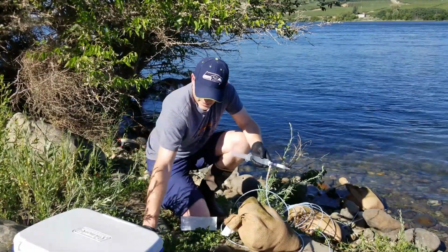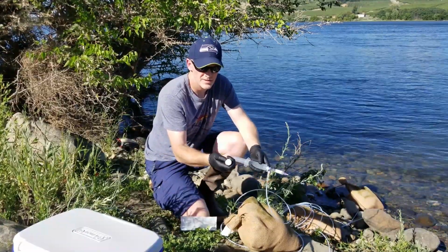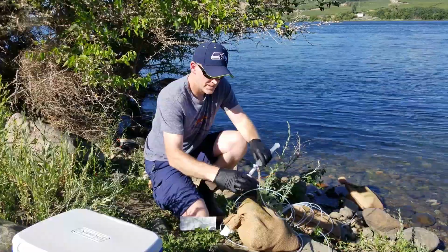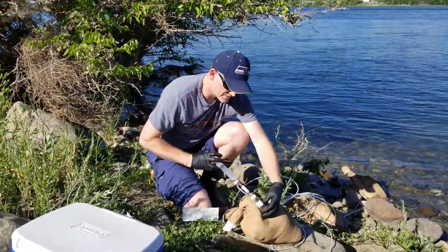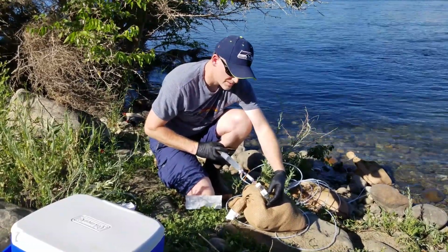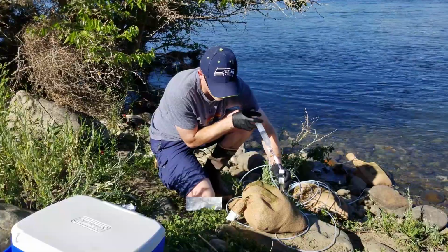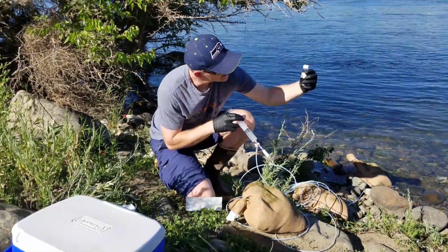Next thing you're going to do is find your clear vial. These have a flip top. You can just pop it off. The septum is there. Please don't touch the septum. Needle goes in through the septum. Now you're ready to collect a sample. These vials you want to push in approximately 20 milliliters. You don't want to go more than halfway full. Samples are going to be frozen. If they're more than halfway full, the sample will burst in the freezer. So that's about right.